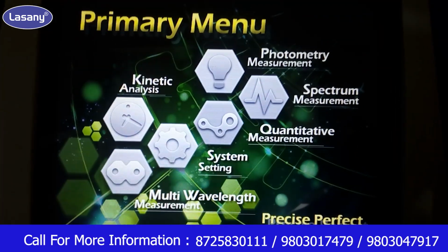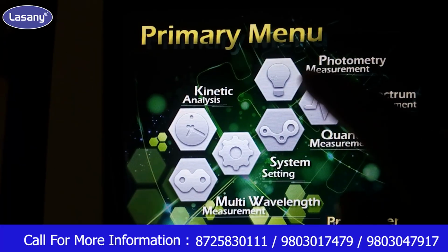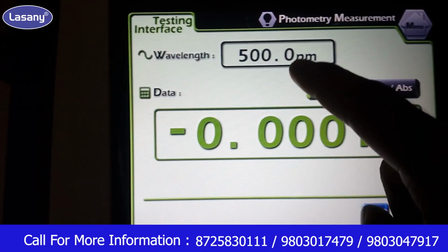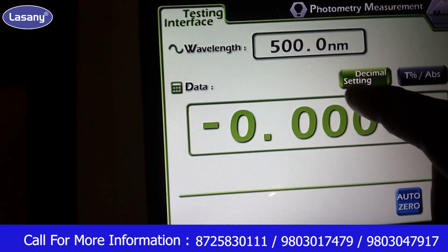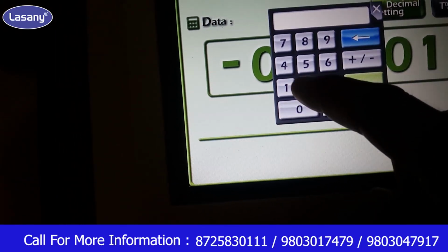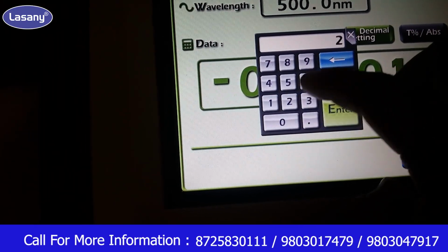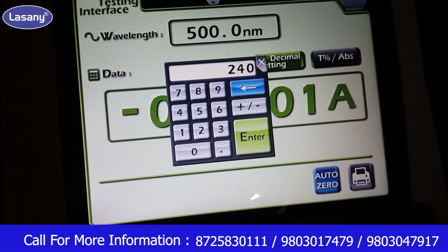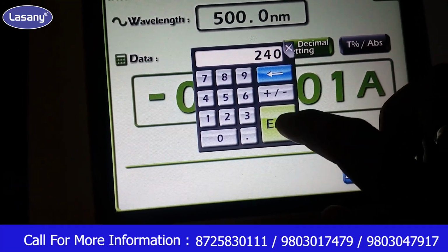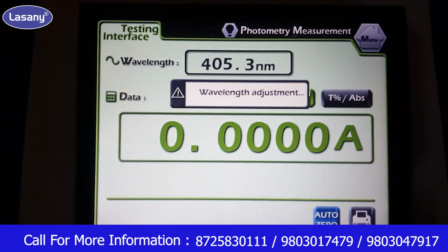So the first one is our basic mode, which is called photometry. Just touch on photometry measurement. Input your wavelength here and enter your desired wavelength to be tested. Like 240 is our desired wavelength to be tested. Enter this wavelength and press enter. It will automatically adjust the wavelength.